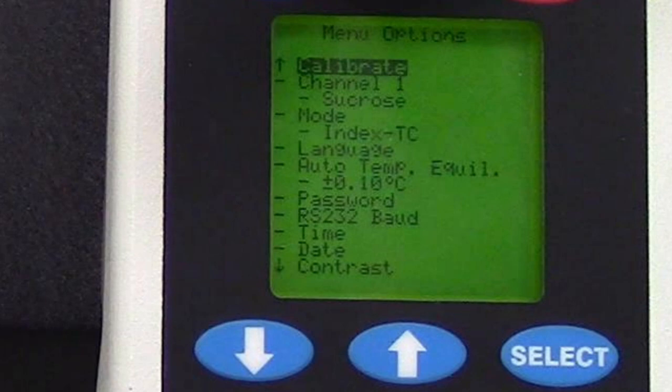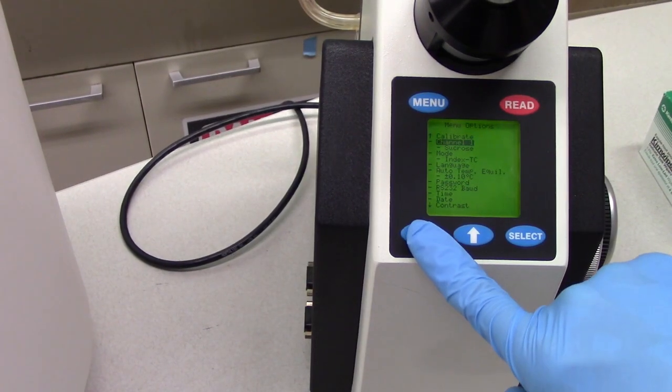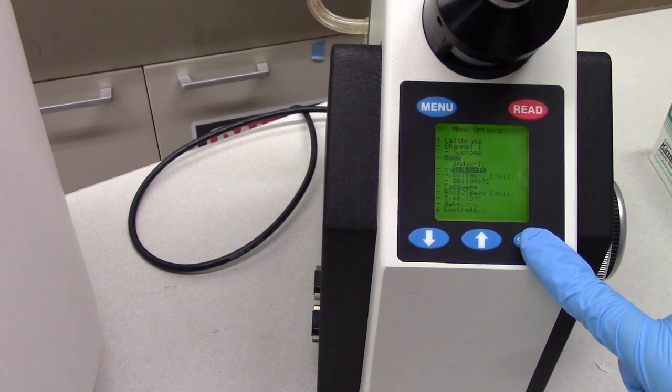On this screen, ensure that the setting under Channel 1 is Sucrose and the setting under Mode is Index TC. If the settings are not correct, navigate the menu with the arrow buttons and press Select.